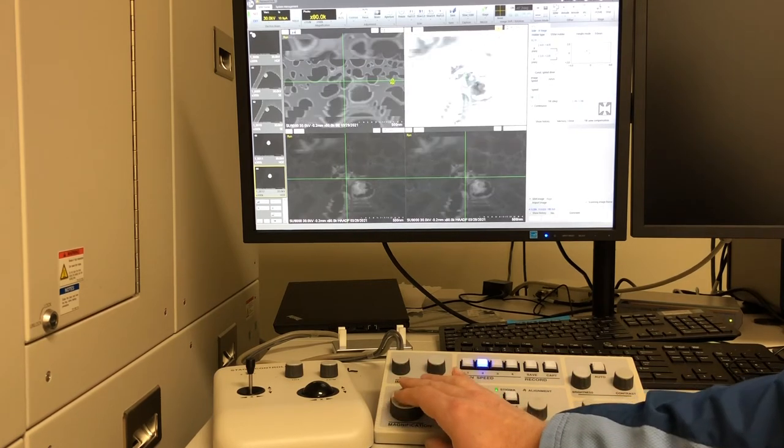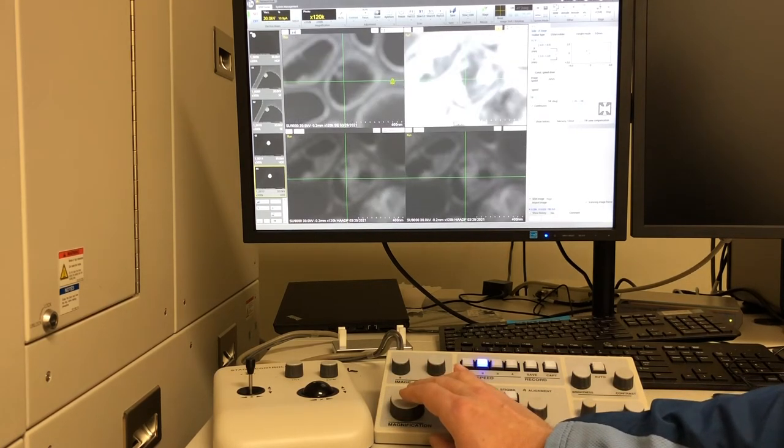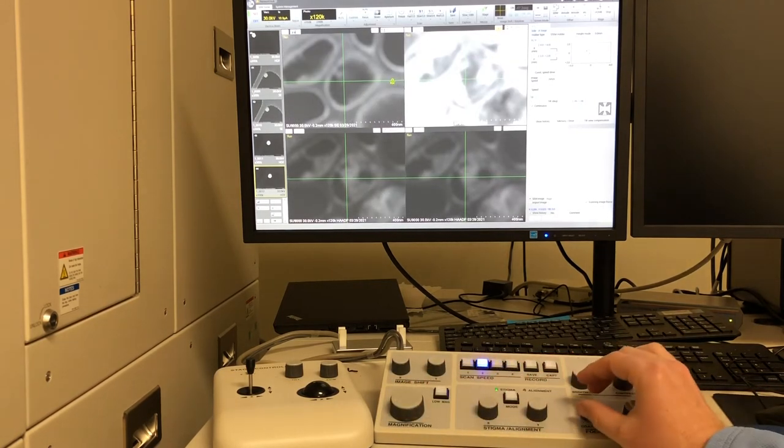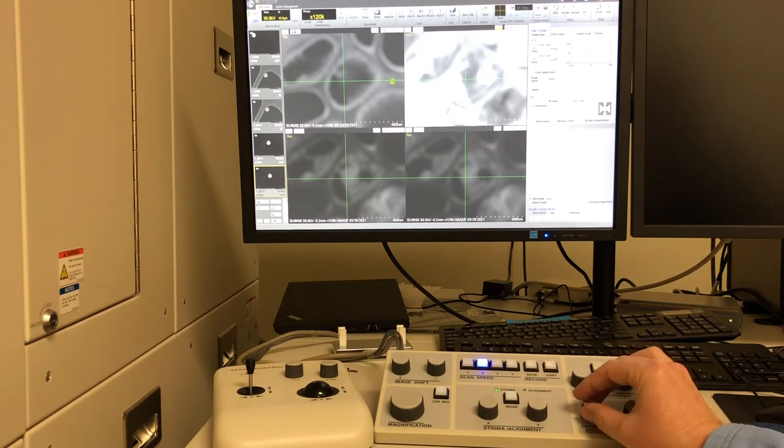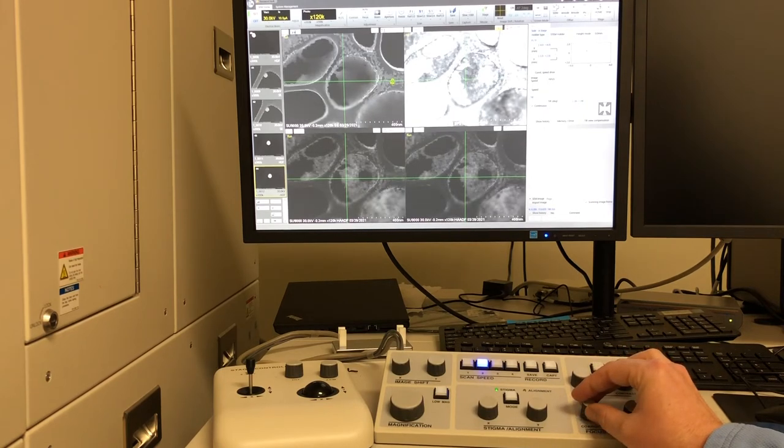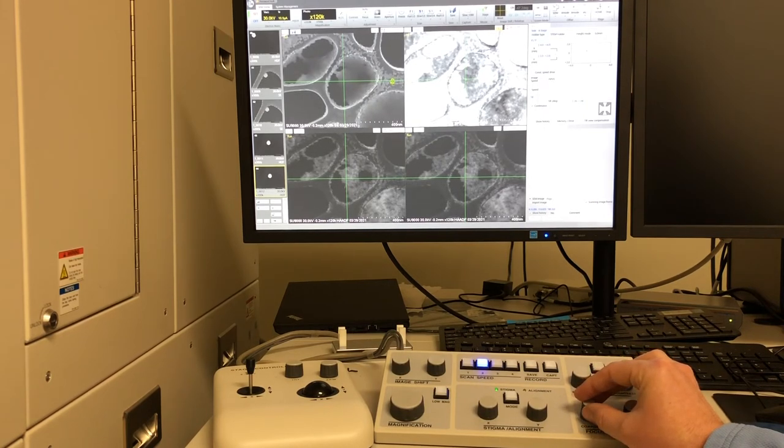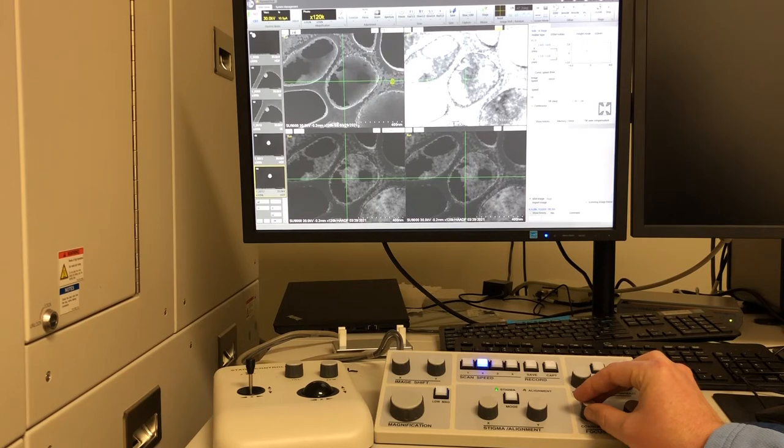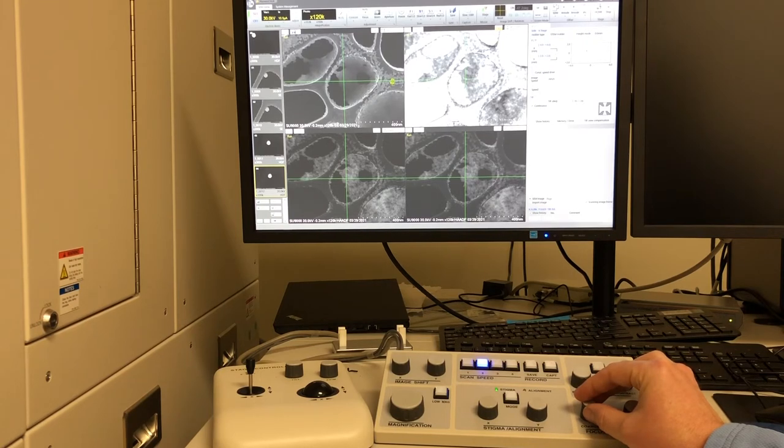Now we'll zoom in some more. And focus. And now we can see quantum dots everywhere.